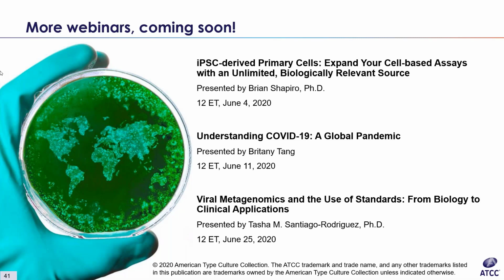I'm wondering if COVID-19 infected cell cultures at the facility. Is it possible for COVID-19 to infect cell cultures in general? And there's something about how to avoid it at the BSL-2 level.